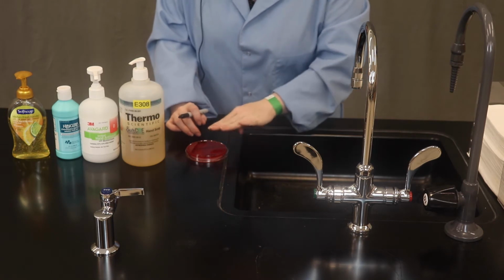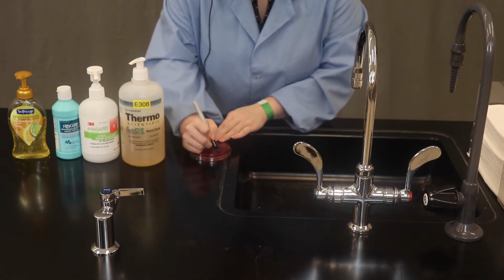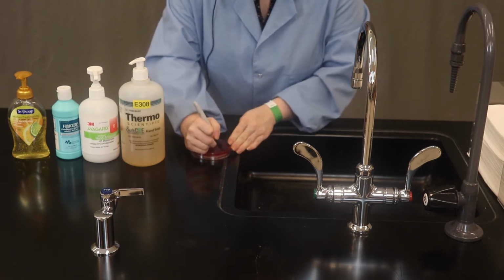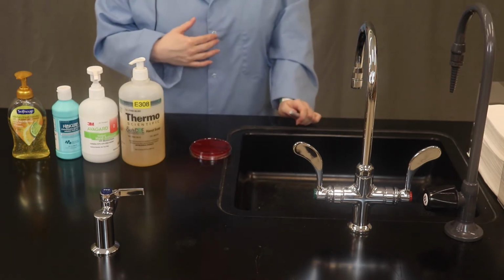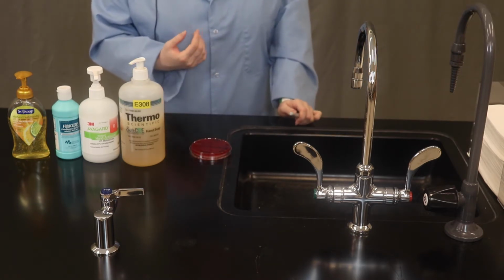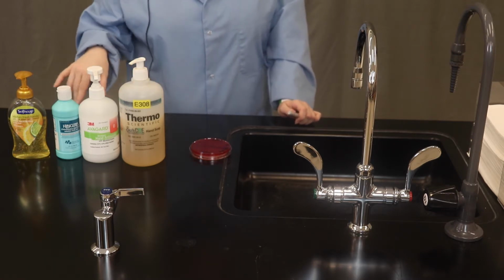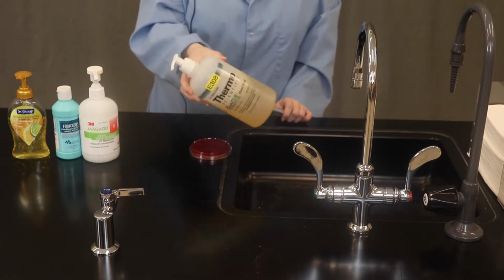So what else do we need to put on here? Like normal, we would need our initials, the dates, the type of agar, and then in this case, we want to indicate our method. You would have a lot of flexibility in this lab. You could choose different types of chemical products. For example, we have antibacterial soap. This is what I'm going to use.